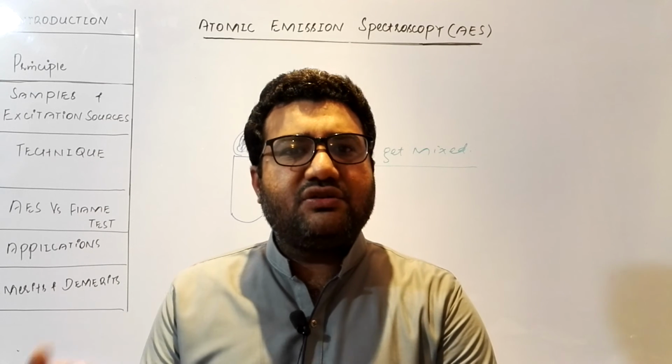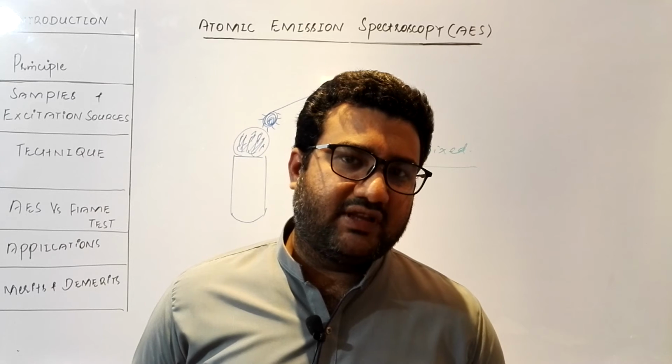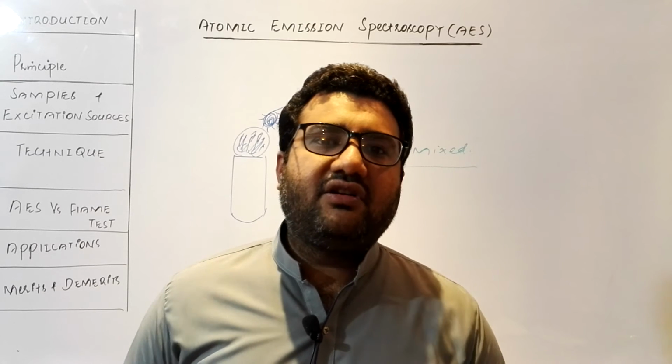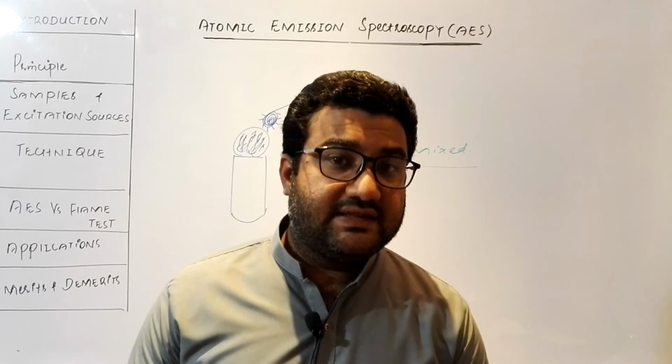So when both show a reddish color in the flame test, how can we distinguish between them? It becomes very difficult. But in the case of atomic emission spectrum, the position of the lines, the pattern of the lines will be quite different in both elements, so we can easily identify them.